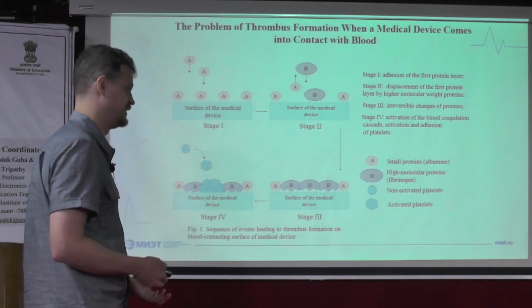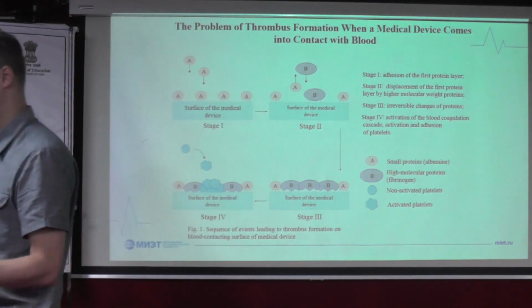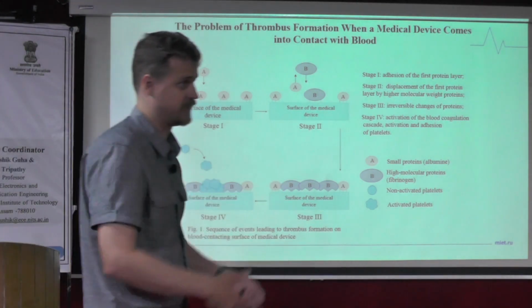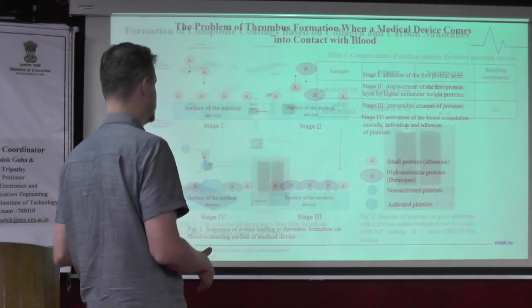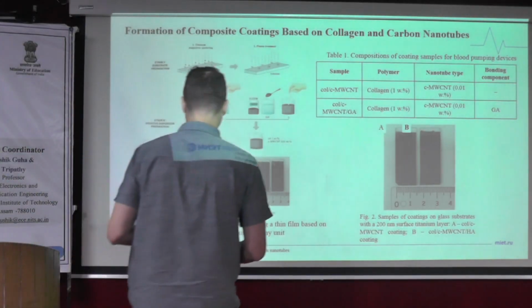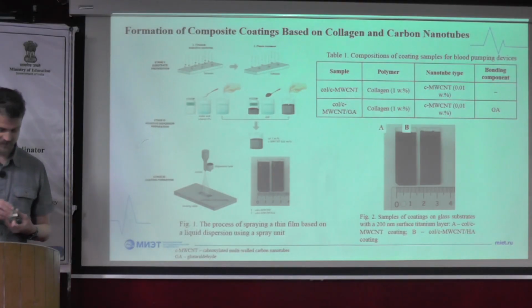And the same sort of idea, if we talk about the biocompatibility and about the safety of the apparatus, including the implantable artificial kidney, we have to think about what kind of film we can provide in order to deal with this type of reaction. For this particular research, a microfluidic system was created.